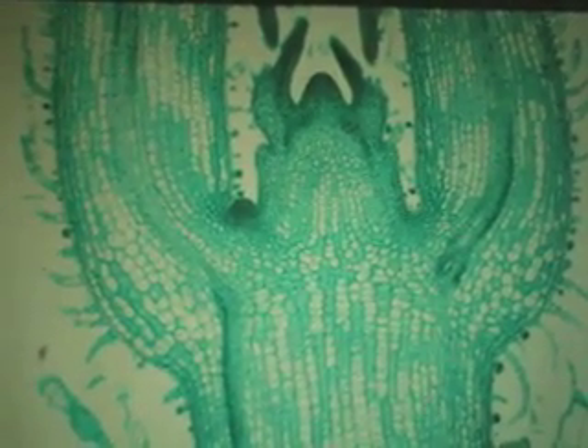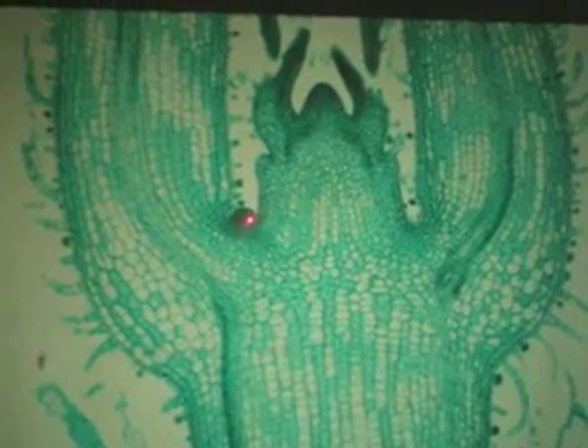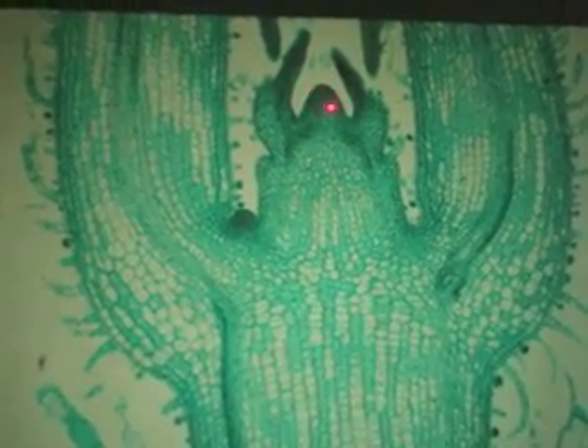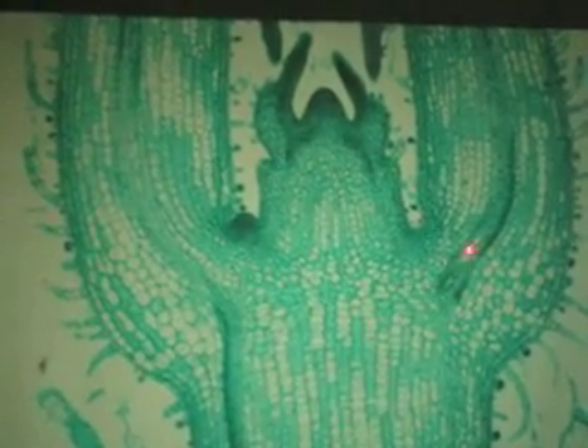I don't have any slides for number 5, the Tilia root — that's a nice woody root, take a quick look at it. Number 6 is the Coleus stem, also in your book. We've got leaves, we've got axillary buds, and there's no stem cap — there's a stem tip meristem. Any dark lines you see would be procambium. The hairs here are technically called trichomes, not hairs.